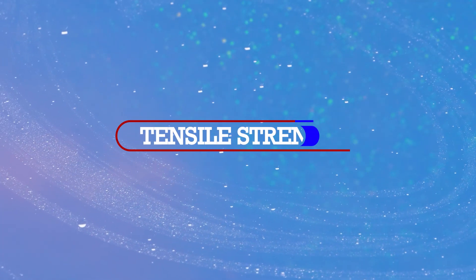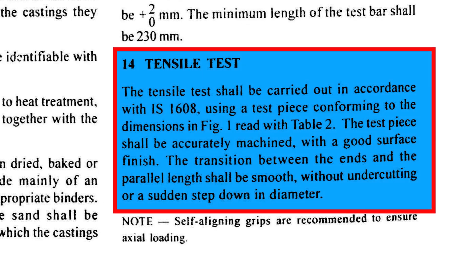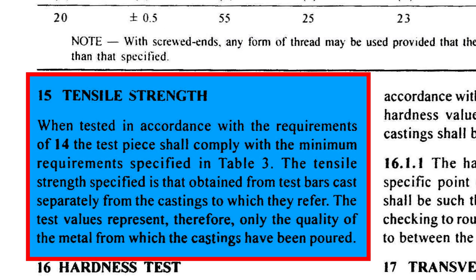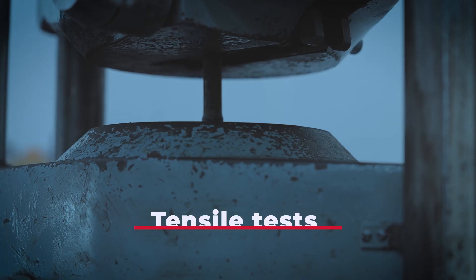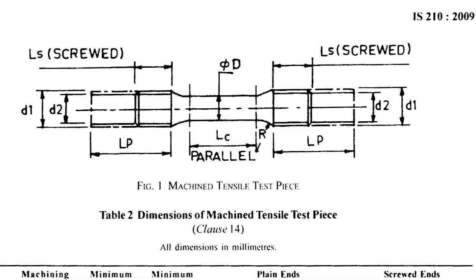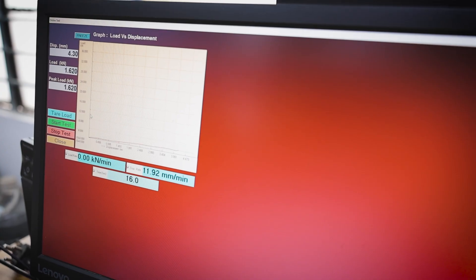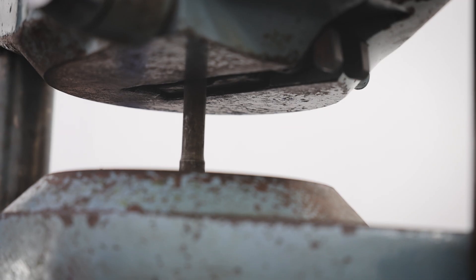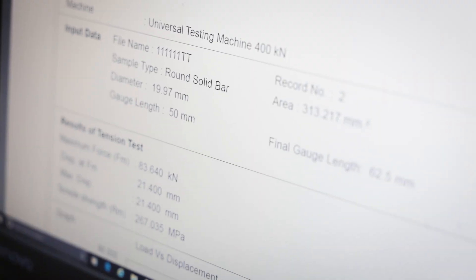Tensile tests are conducted to assess material strength, elasticity, ductility, yield strength and suitability for applications. They help determine a material's behavior under stress, ensuring it meets quality standards and performance requirements, and this information is essential for material selection, design and regulatory compliance. To conduct the tensile test: prepare a sample from the cast iron bar ensuring it meets dimensions specified in the standard; secure the sample in the UTM using appropriate grips, making sure it's tightly fastened; enter test parameters into the software including gauge length and cross-sectional area; then initiate the test. As the load increases, the sample will eventually break under stress and the software will automatically display the tensile strength of the sample.